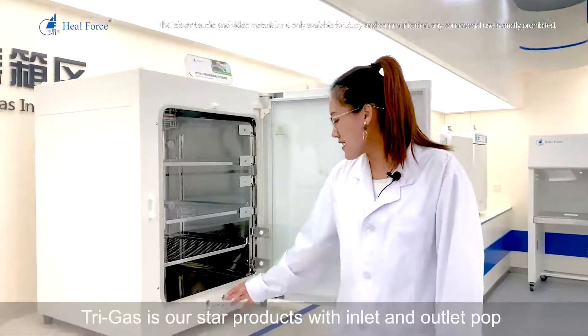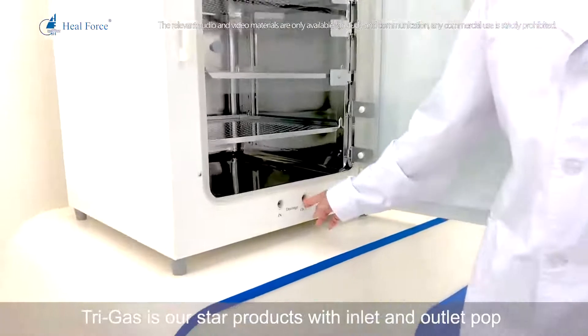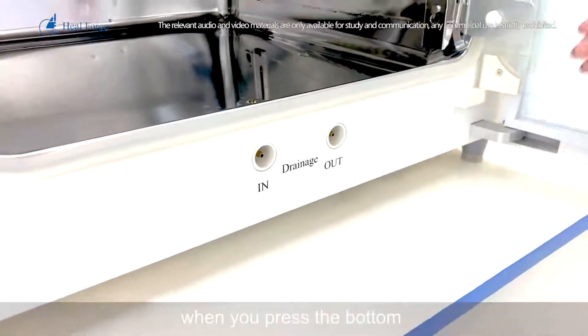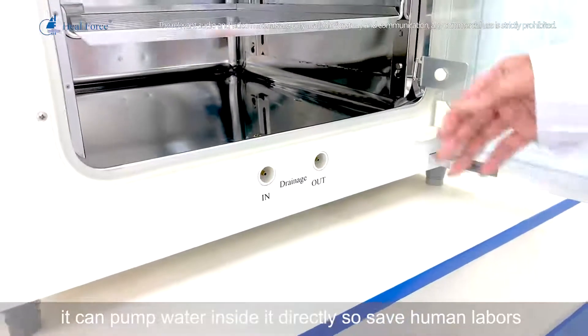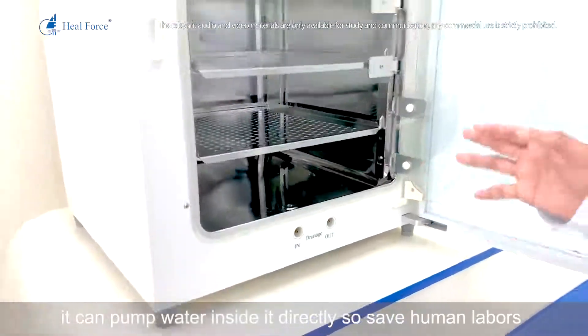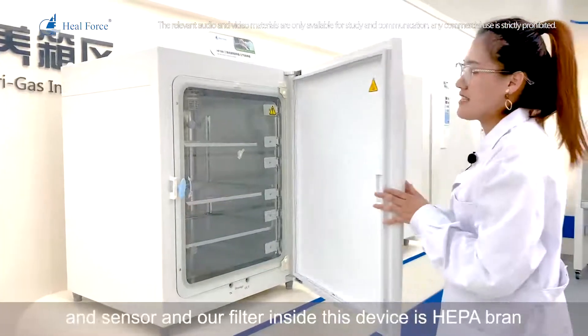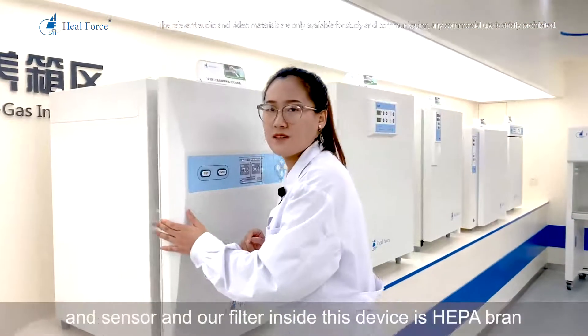This tri-gas model is our star product. It features an inlet and outlet port connected to a water pump — when you press the button it pumps water directly into the pan, saving labor. The most important component is the carbon dioxide filter and sensor; the filter inside this device is HEPA brand.